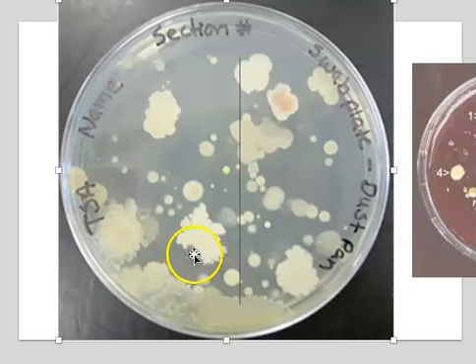I want you to look at this strange colony right here. This is one colony, but how unusual. It doesn't look like a nice circle. It doesn't have an even edge. It's quite unusual. It doesn't have any kind of a symmetric look to it. And there's more than one of these on this plate. There's one here. There's another one here. There's one here and here. There are many different organisms out in the world. And while we sample from the environment, we have to expect to get some unusual sizes and shapes, unusual colony morphology.